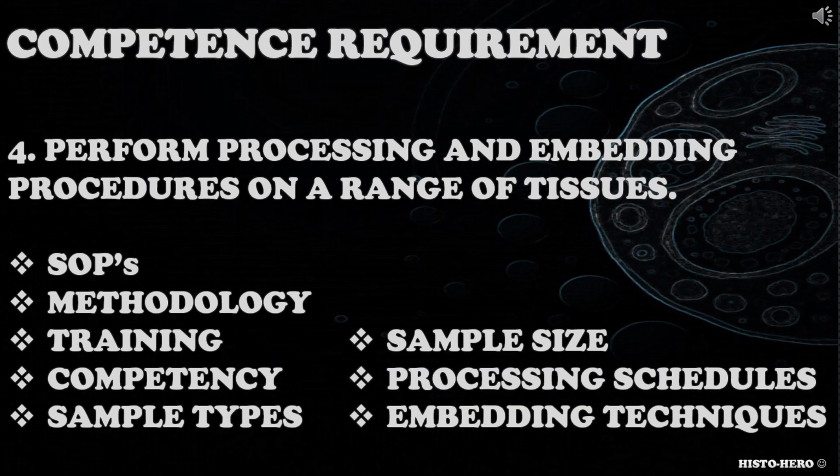When addressing this competence requirement, candidate could consider SOPs, methods used, their training and competency, type and size of samples, processing schedules available, embedding techniques and so on.